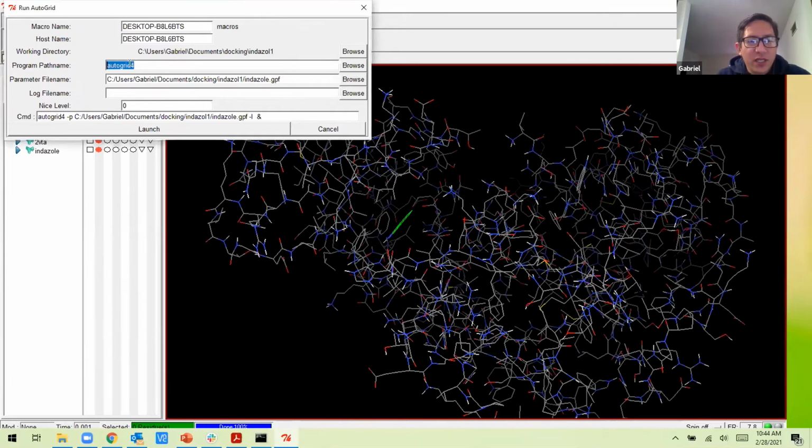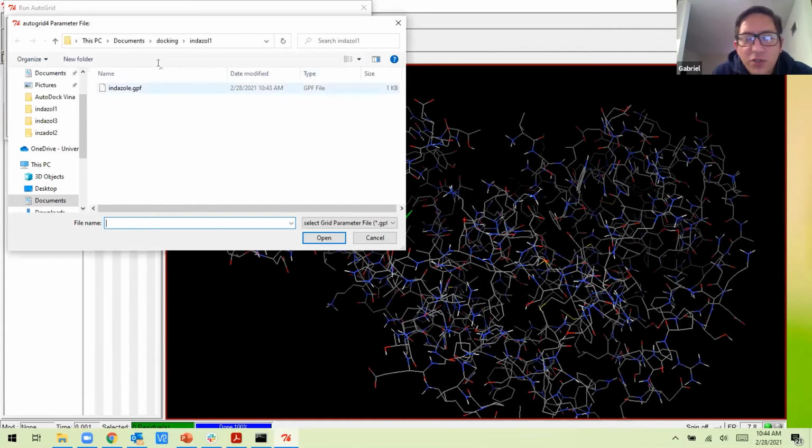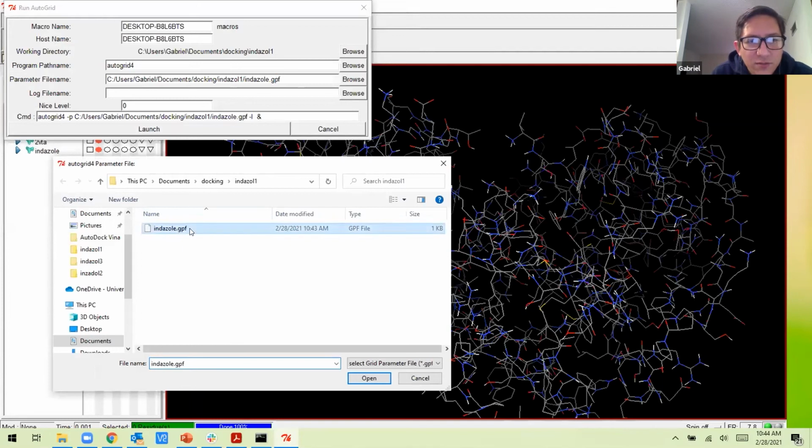It's going to read this executable file. Then we go to Browse, and choose the one that we just wrote down, indazole, and then select it.